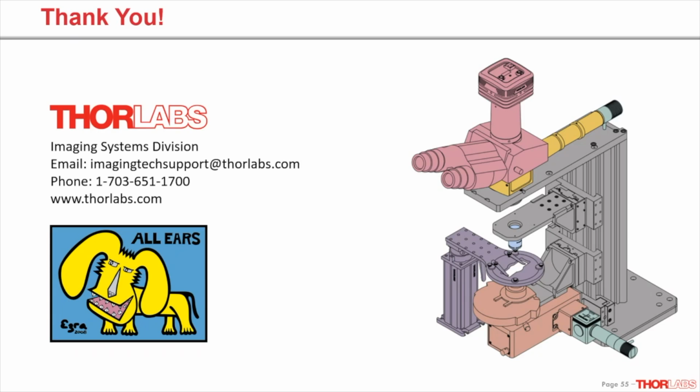DIC will give you better edge and internal organelles of the cell, if you're looking at cells, kind of highlighting the structure, whereas phase or dot would be a little more like phase, where you might not necessarily get the full structural effect out of that image. You'll be able to visualize it, but you might not necessarily be able to see the contrast, the difference between, say, an internal part of the cell versus that organelle.